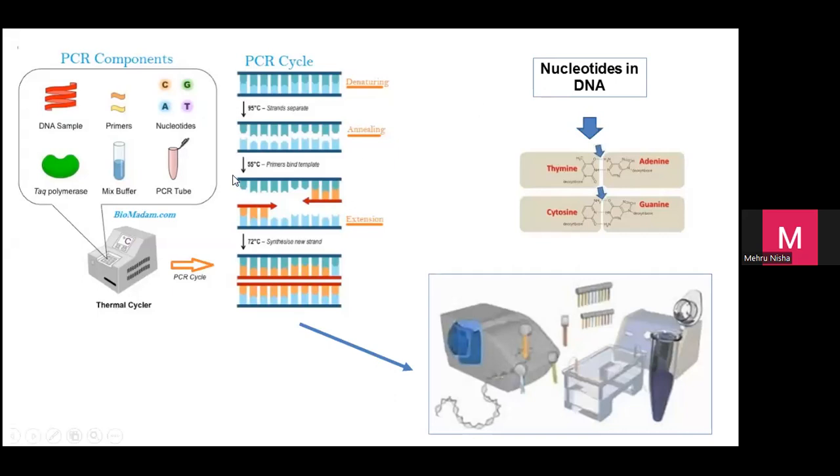Masa I learn PCR, masa tu kita kena satu-satu kita add. Tapi sekarang mostly the companies, and I know I read some journals in Indonesia pun dia dah guna yang pre-mix. So apa yang you kena add is just primer, DNA sample dan air. Then just masuk di mesin. So that is the advance of all the biotech in the whole world. Tapi save your muscle. So lah kalau tak, berapa you nak pipette kan? Okay.